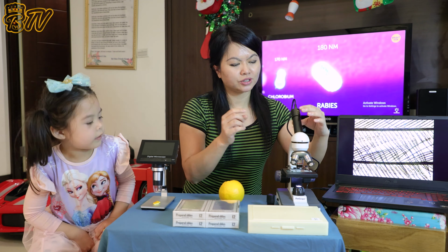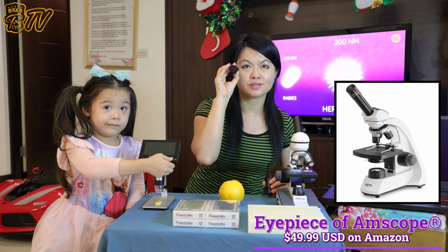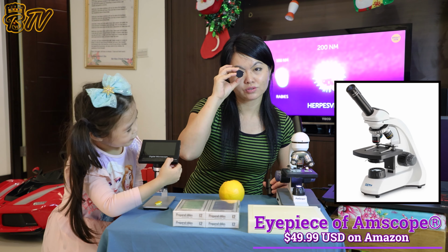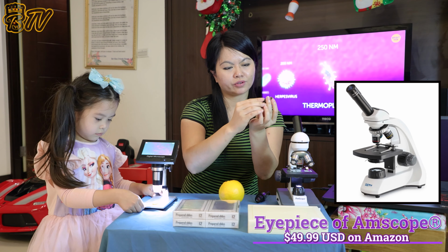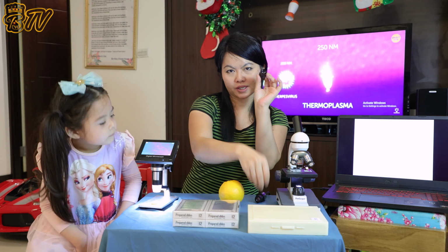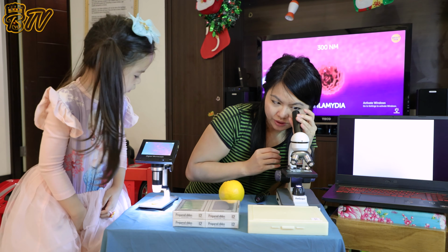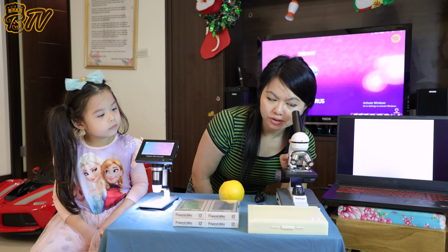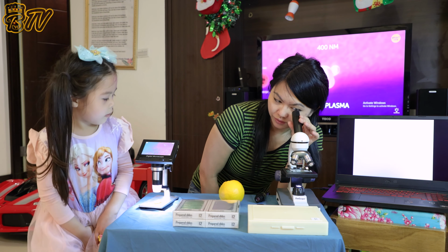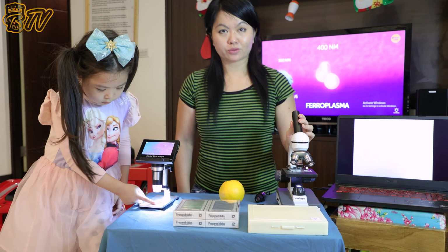There's another way to look at it, through your eyepiece, okay? The eyepiece itself and the camera is like $50 on Amazon. So it comes with a little cover. You take off the cap first. Okay, so you took off the cap and then you hook it right in. You can look at it through your eyepiece, okay? This is called an optical microscope. This one is actually just for adults. It can see the feather really clearly through the microscope, okay?